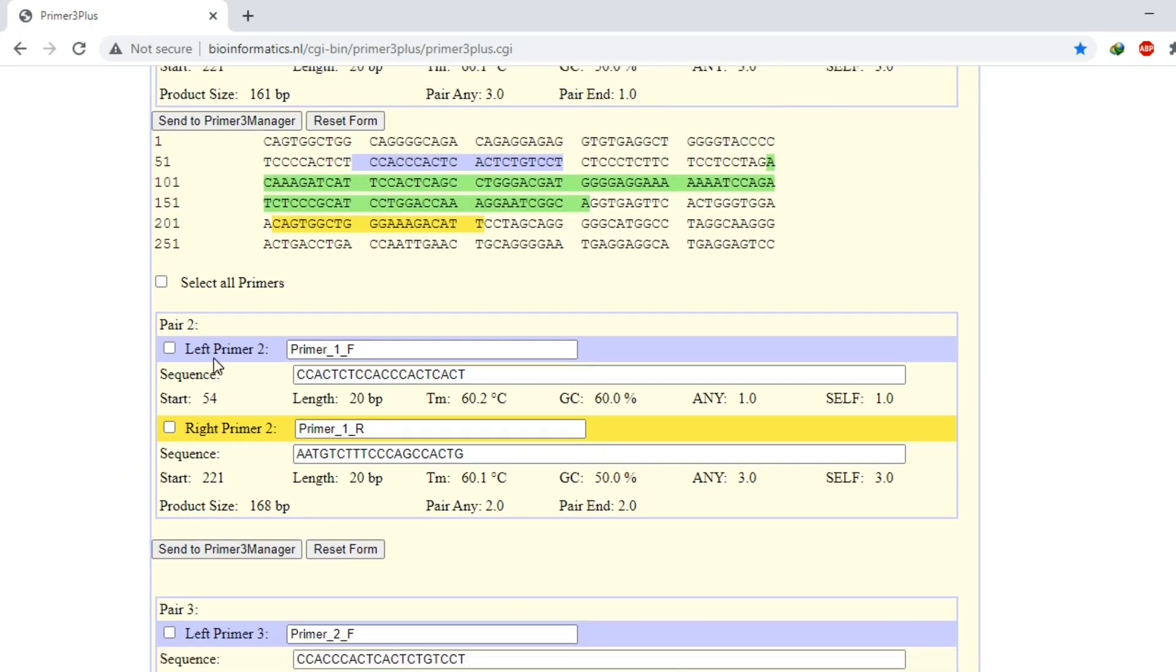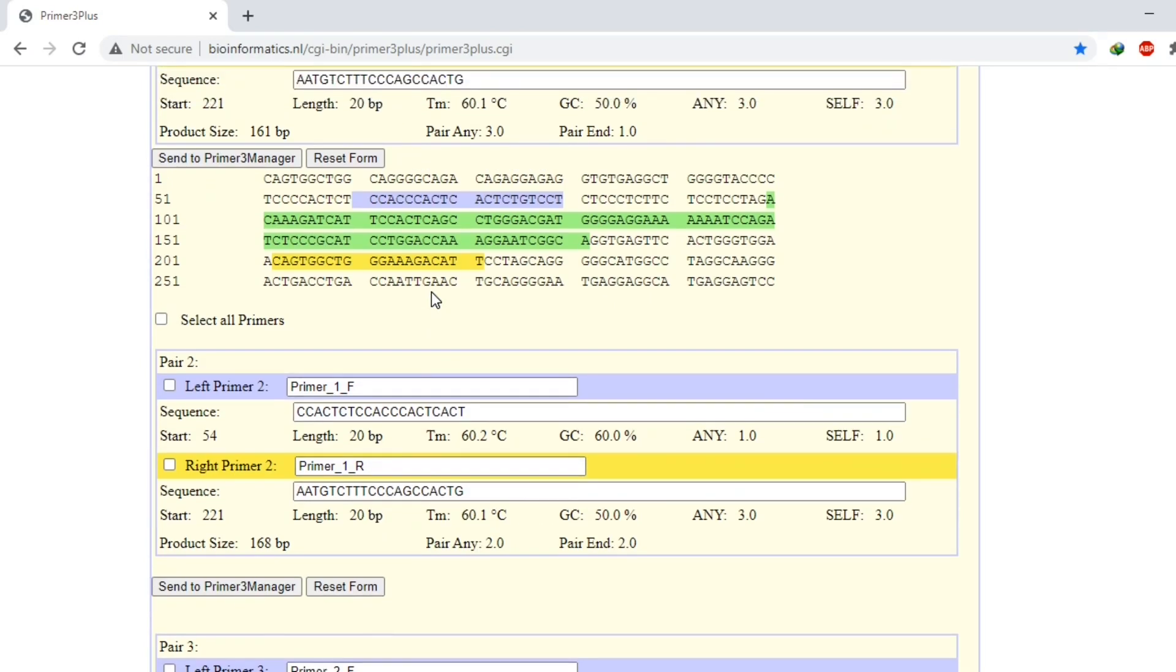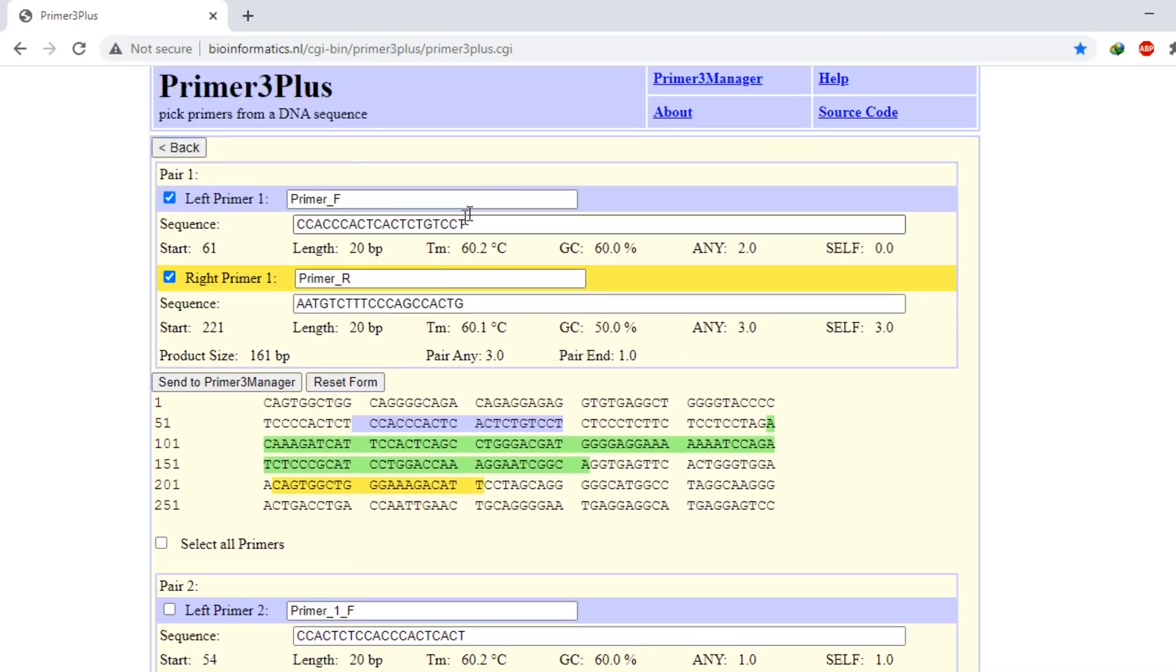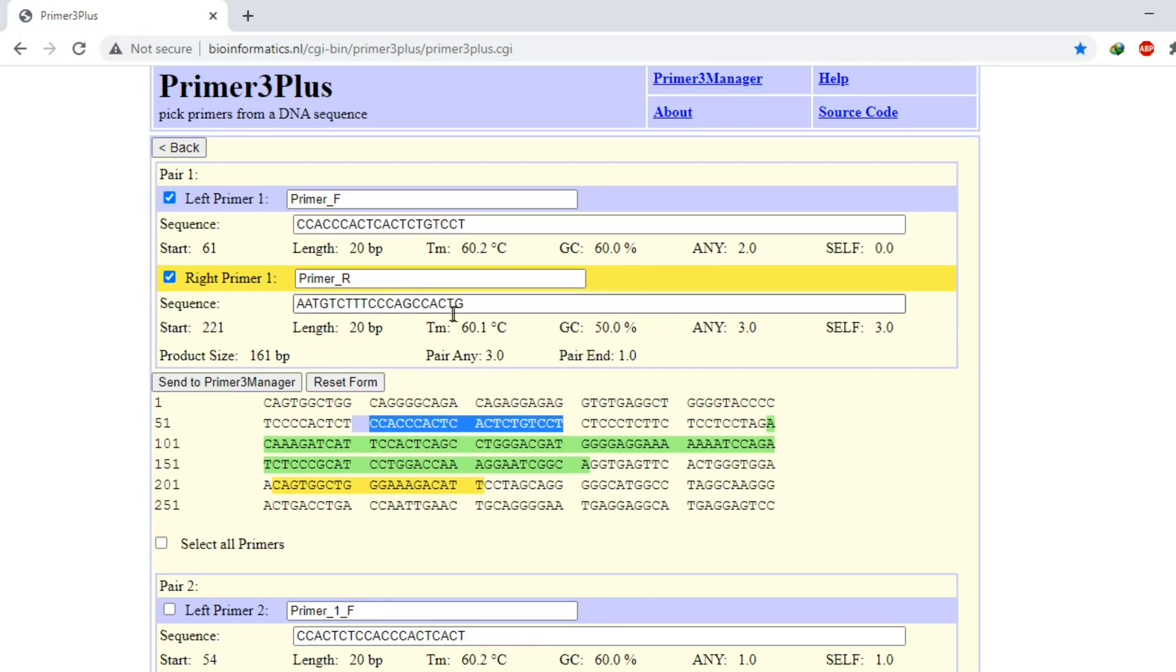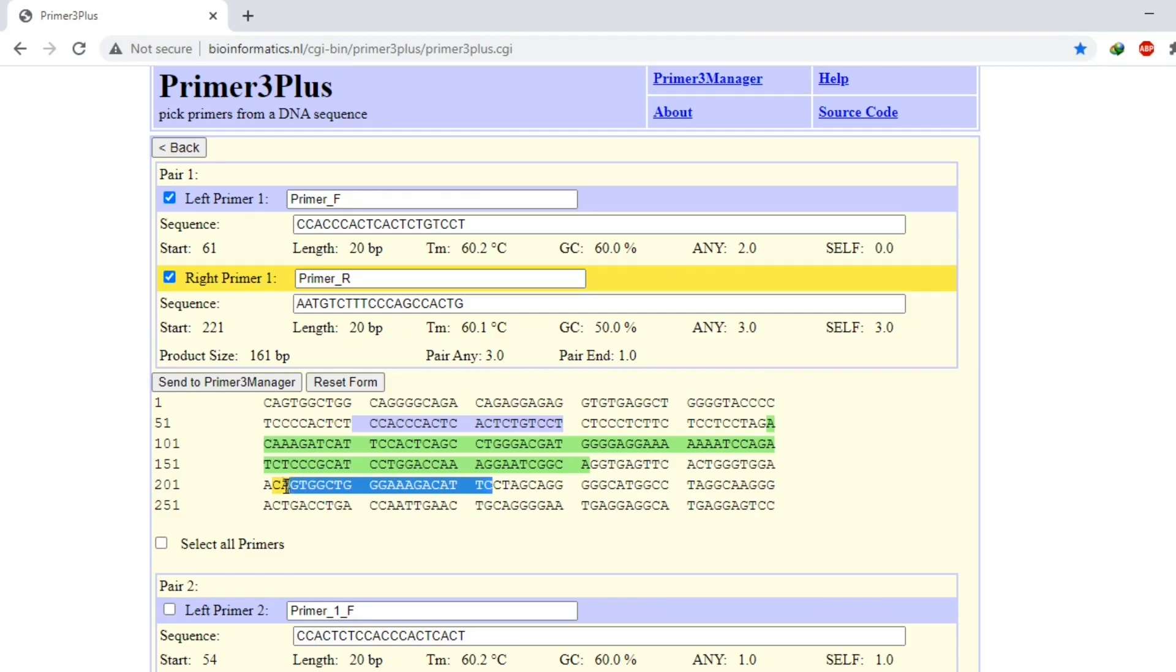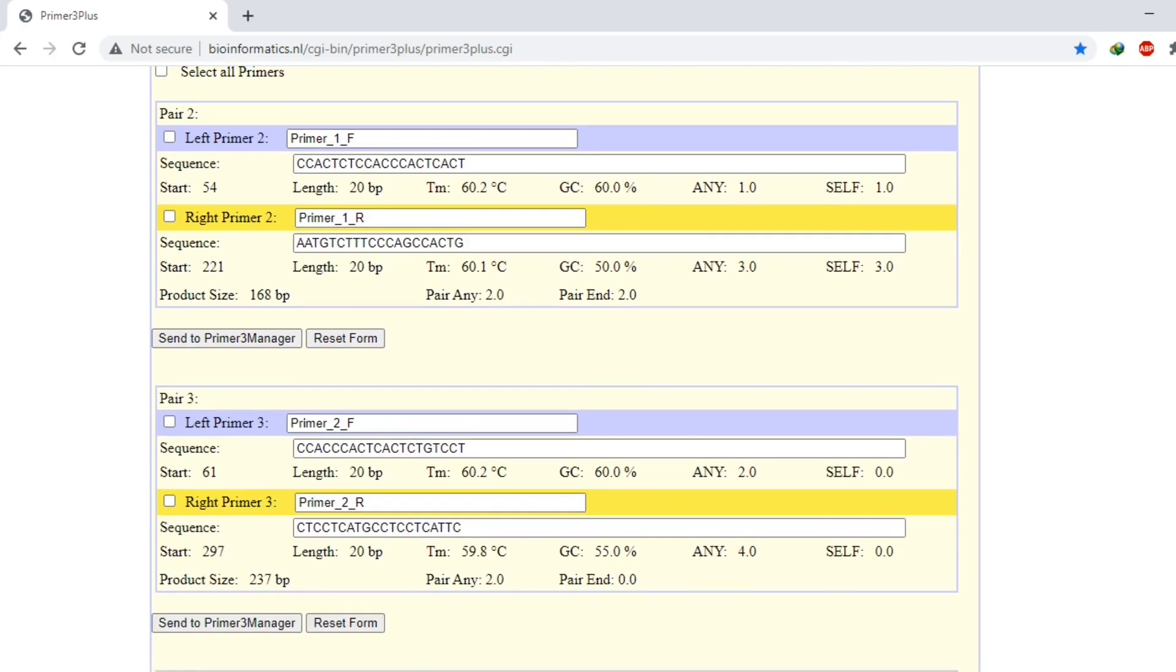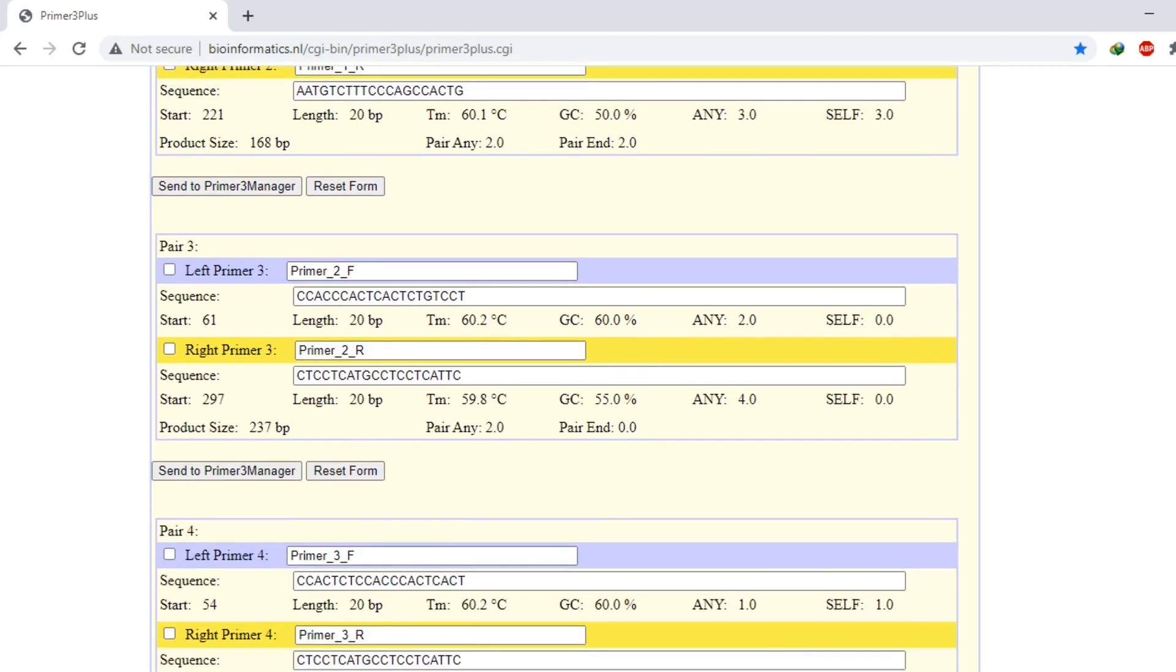This is our pair two. Its length, melting temperature, everything is given here. And this first forward primer is attached here, and the reverse primer will be attached here. You can try any of the primers which you want.